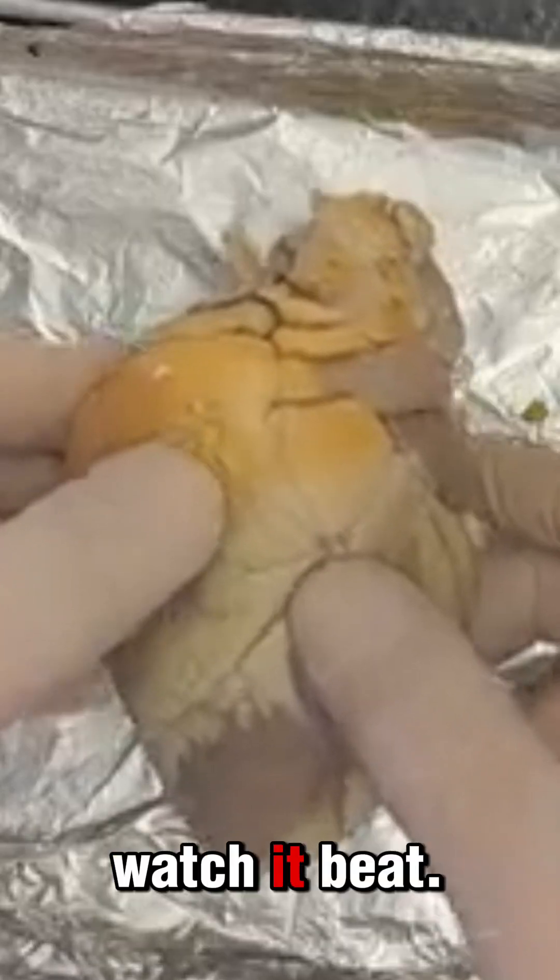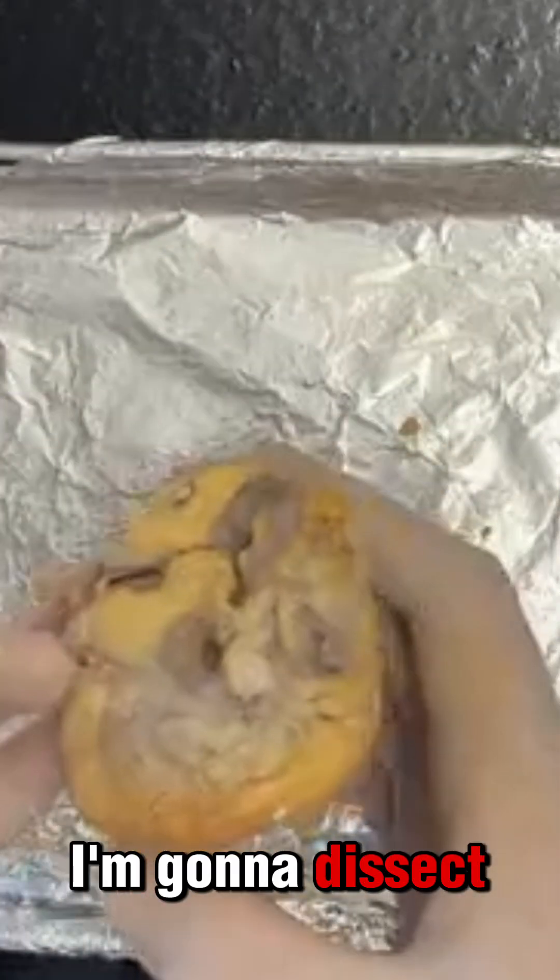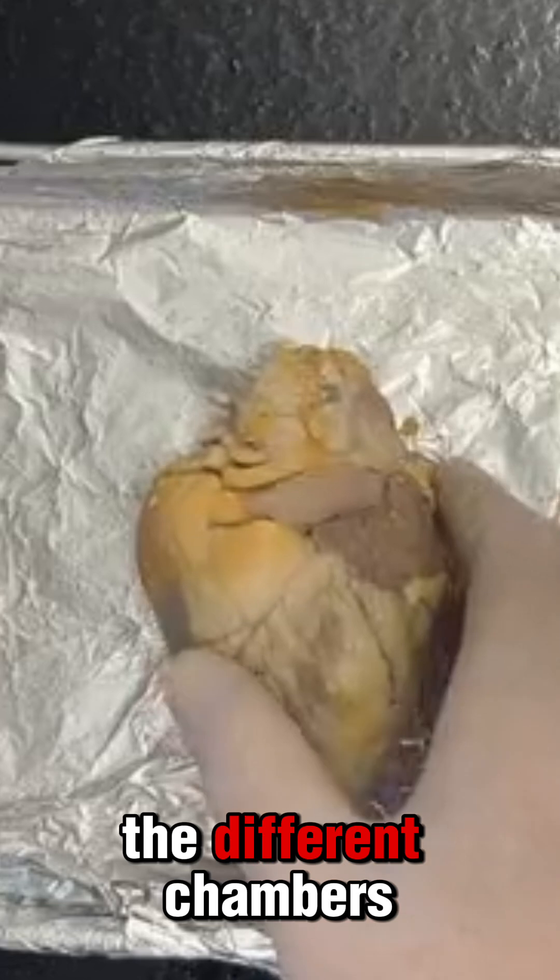Sheep heart dissection. Here I have a sheep heart. I'm going to dissect the sheep heart and take you through all the different chambers.